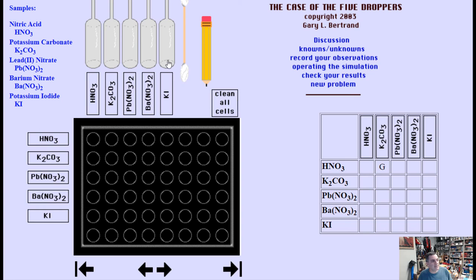Here, let's take the lead 2 nitrate and we'll put it here because I'm going to mix it with the potassium iodide. I'm going to put a drop or two in there. Now I'm going to click on my potassium iodide and I want to make sure I go into the same cell. See, I'm lining up potassium iodide with lead nitrate, they intersect right here. Click and I'm going to add. Check that out, I got a precipitate! Not only did I get precipitate, check it out, it's yellow. So that gives us some really neat information. Then I could go over here to my observations, click the pencil and put my information there, although you're going to do it on paper so don't worry too much about that.